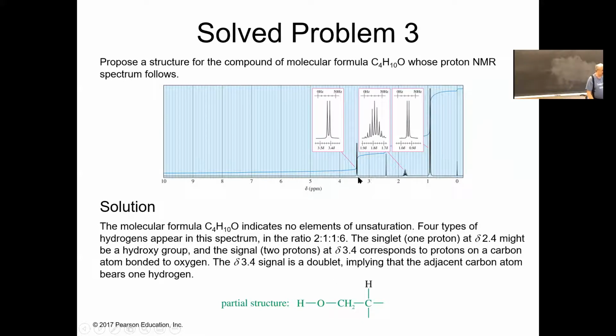All right, so let's take a look and see what we've got. Okay, we've got a doublet. Okay, and sometimes if we're not sure how many lines we have, we just call it a multiplet. Okay, so we got a doublet, a multiplet, and another doublet. And then it looks like we also have a singlet here. So I would say this is probably an alcohol.